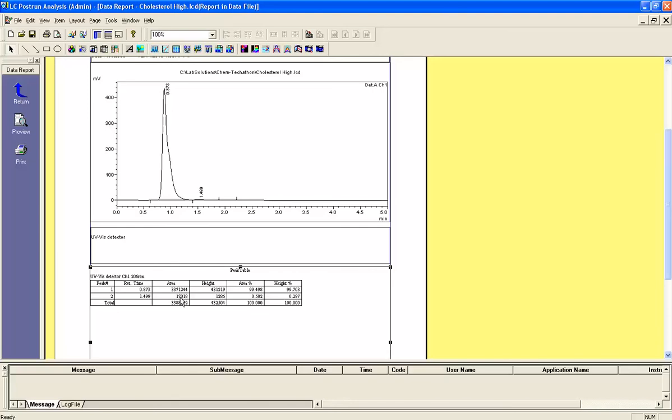Alright? If I wanted to print this off, because maybe I want a sheet of paper that tells me what to do, the only thing I have to do from this point is hit Print over to the left, and this will print off on a physical sheet of paper that I can then put into my lab book and reference from that point on.